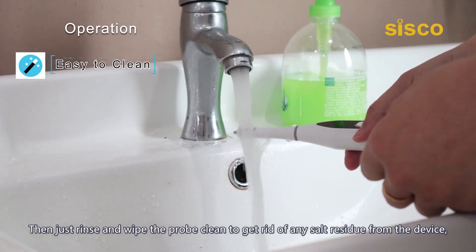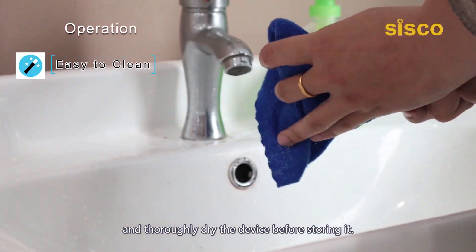Then rinse and wipe the probe clean to get rid of any residue from the device, and thoroughly dry the device before storing it.